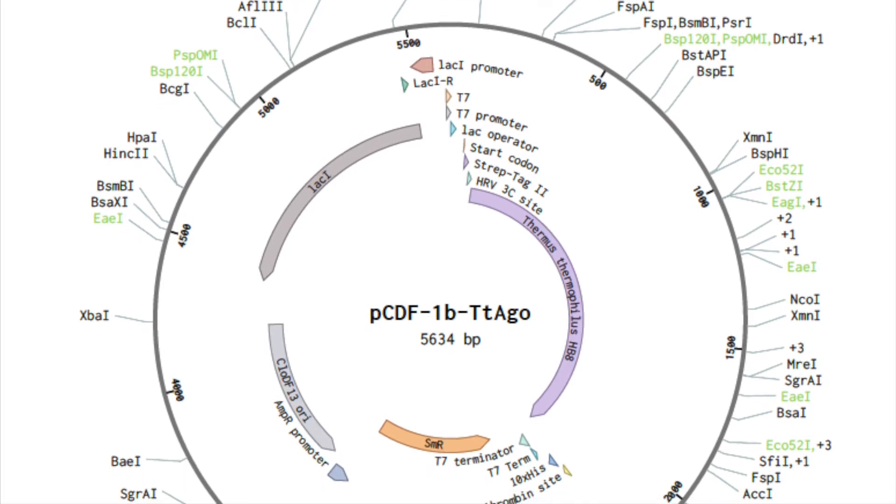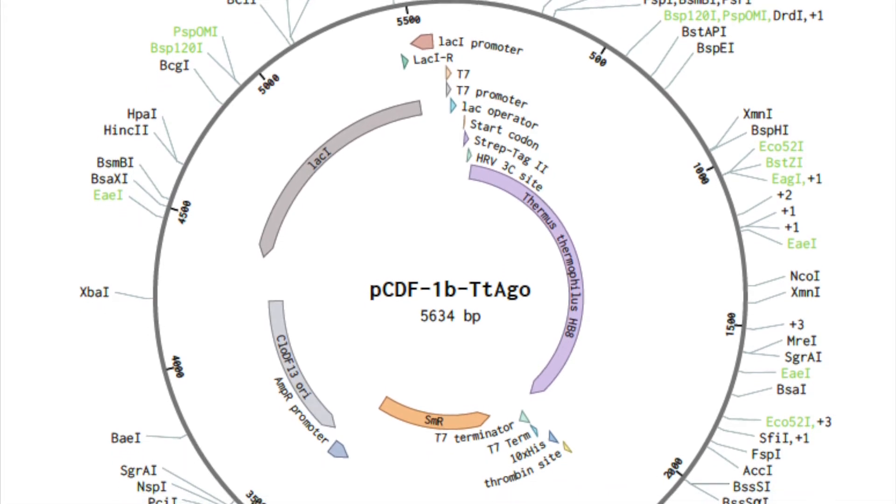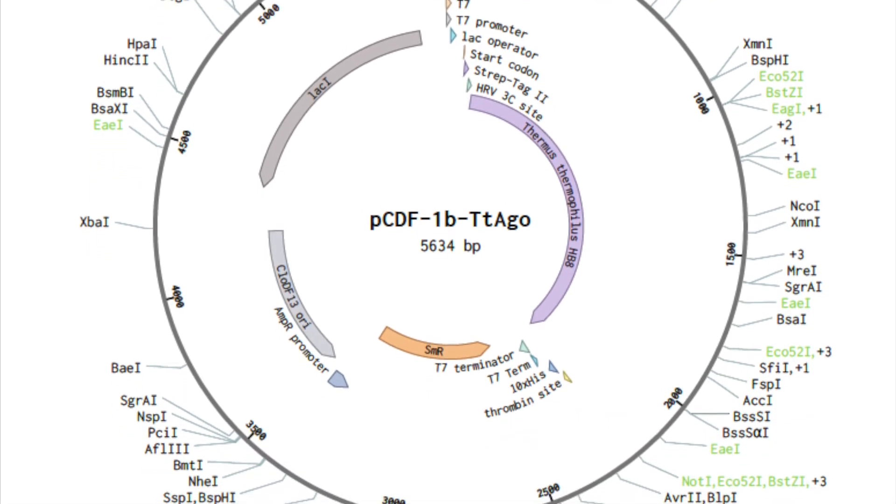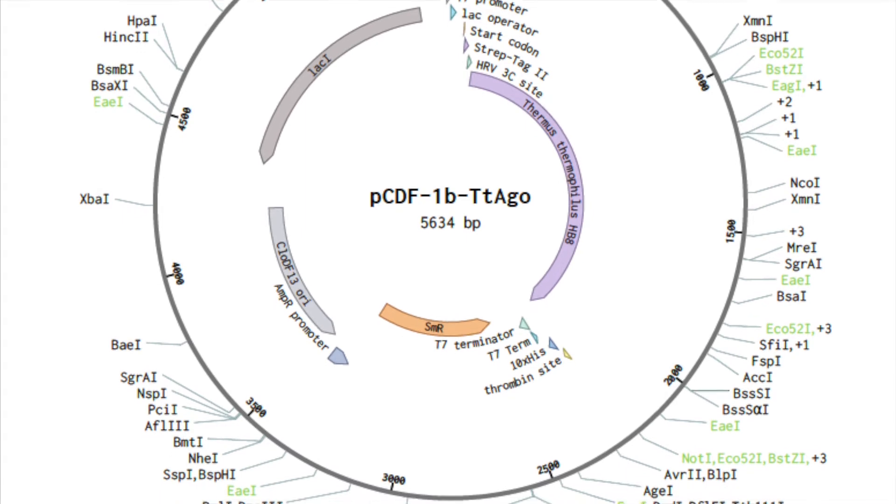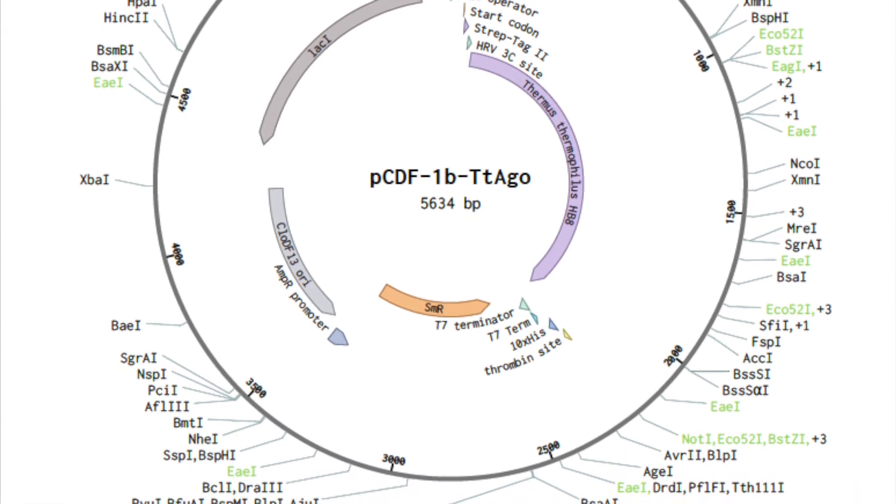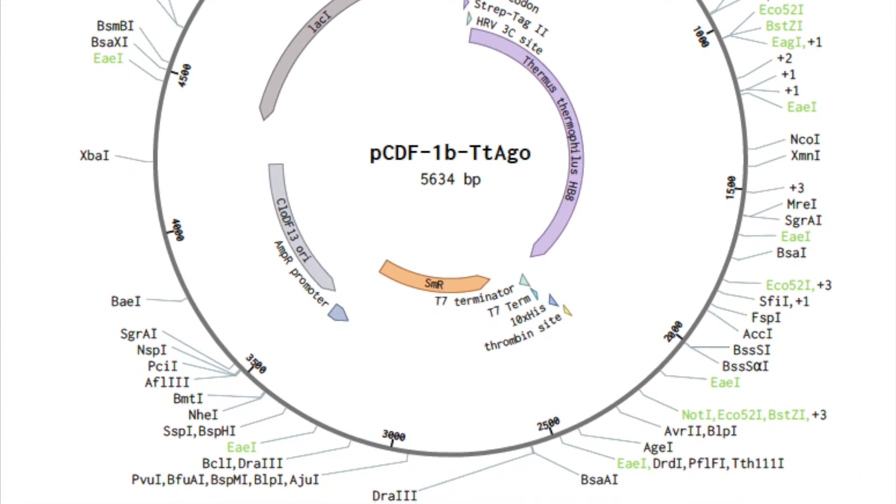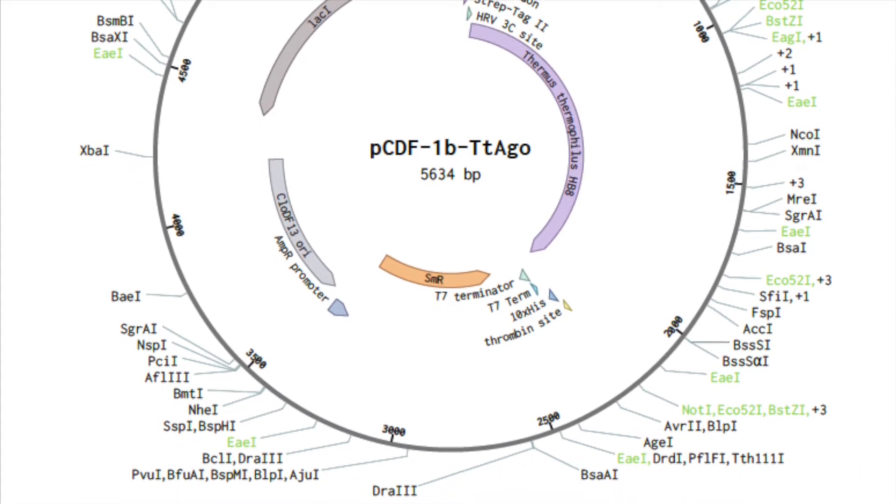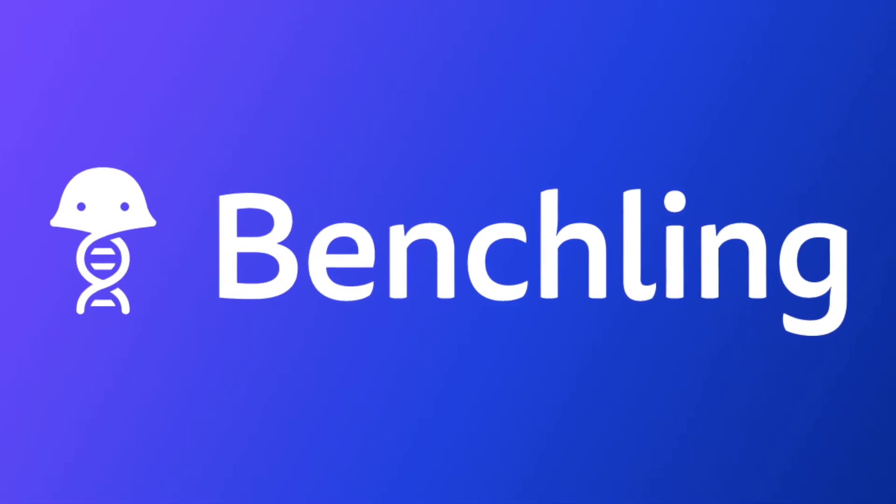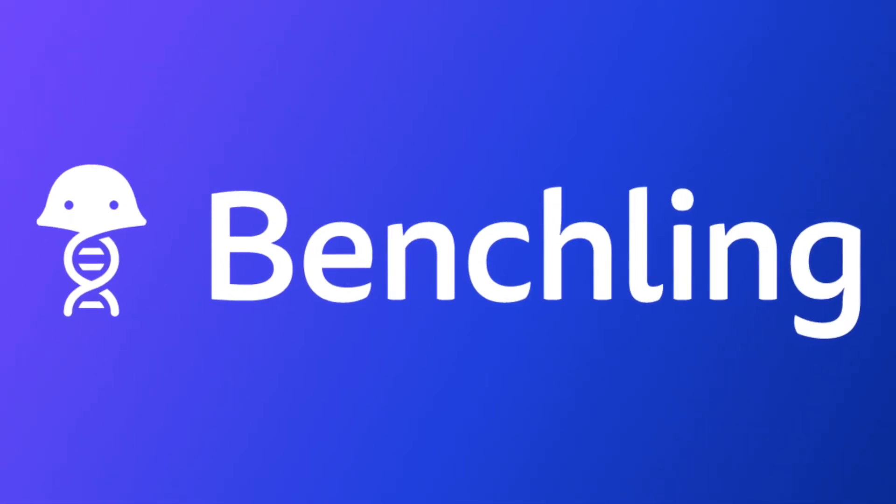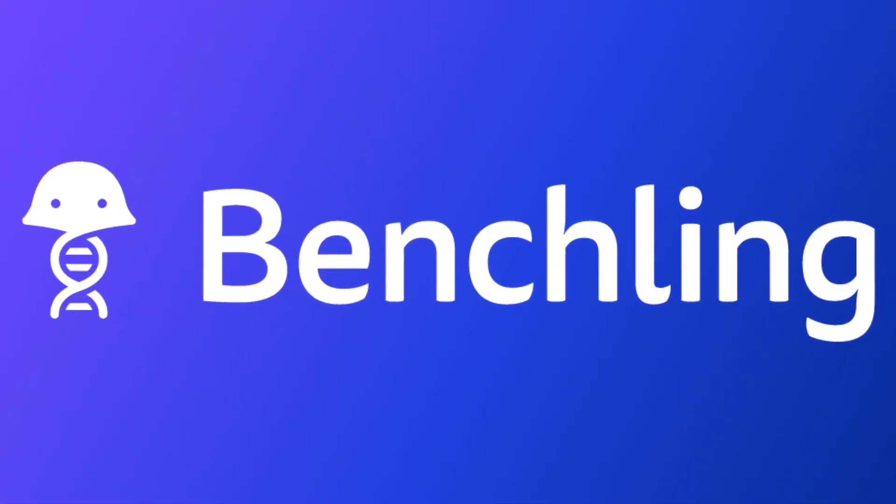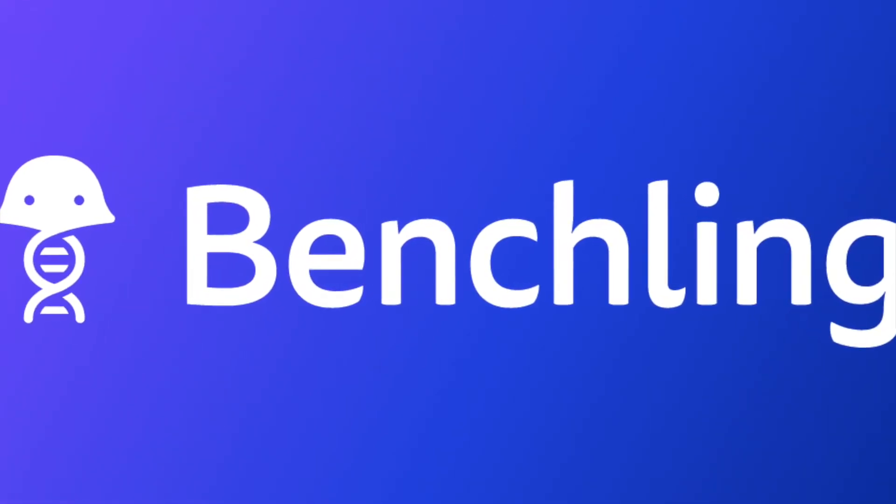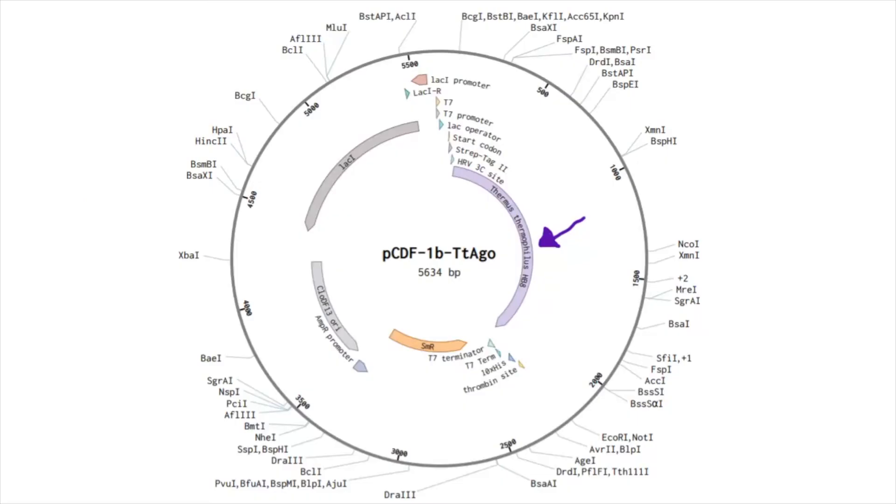The plasmid we will be working with is called PCDF1B-TTIAGO. This plasmid contains a gene that codes for argonaut protein TTIAGO. We are going to use Benchling to identify and use restriction enzymes to isolate the TTIAGO gene from the plasmid. Here is an image of the plasmid we are going to work with. As you can see, the TTIAGO gene, or our gene of interest, is annotated in purple. Benchling automatically annotates any FASTA or GenBank file upon upload, which is shown through the colorful labels.